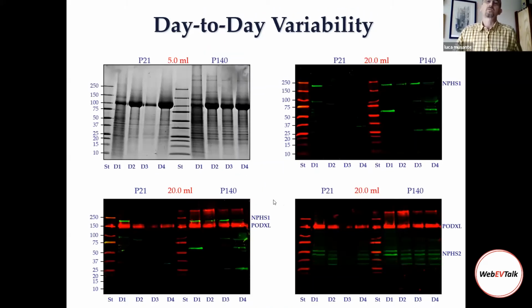Western blot analysis of some of the markers that we were interested in at that time, and our podocyte marker, very specialized epithelial cells forming the glomerular filtration barrier. You can see different recovery in different samples on different days. I wish I could have had available at that time some reference material to spike in the urine at the very beginning of the centrifugation protocol, like the material that Dr. Hendricks presented a few weeks back, to normalize for the final recovery of the reference material and not for the final volume.